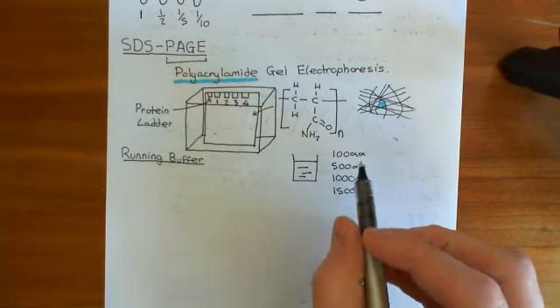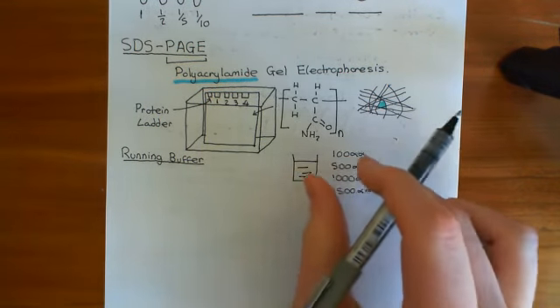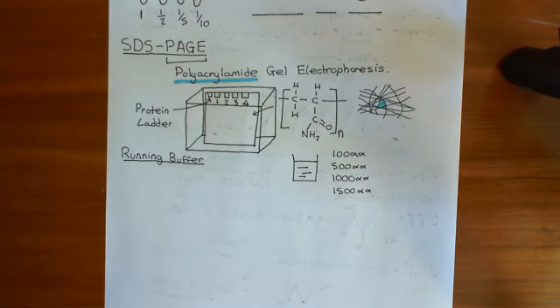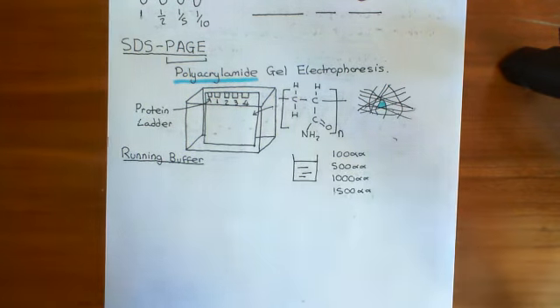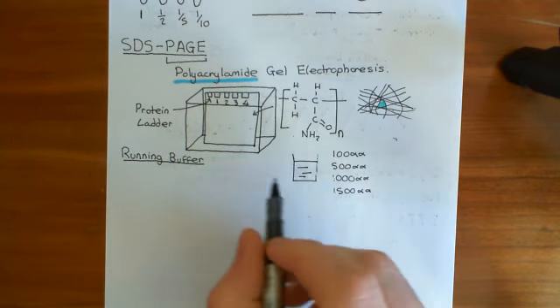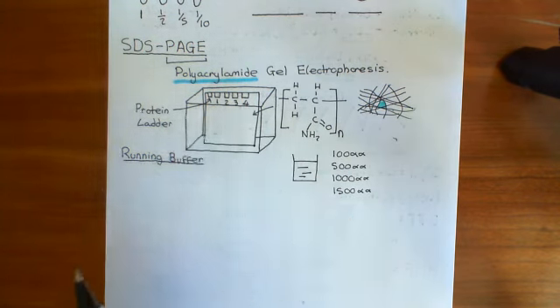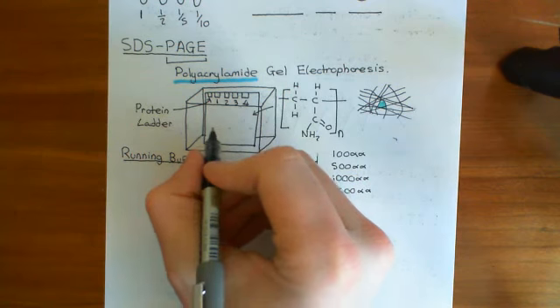And you will also often find that in these protein ladders, the proteins will have visible dyes attached to them, so that you can actually see the molecules. Some of them won't, but some of them will actually be visible to you. You'll be able to see them as they move down the gel. So some of these proteins will be labeled with something that colors them, and they'll have different colours, so you'll get like a little rainbow coming down here.